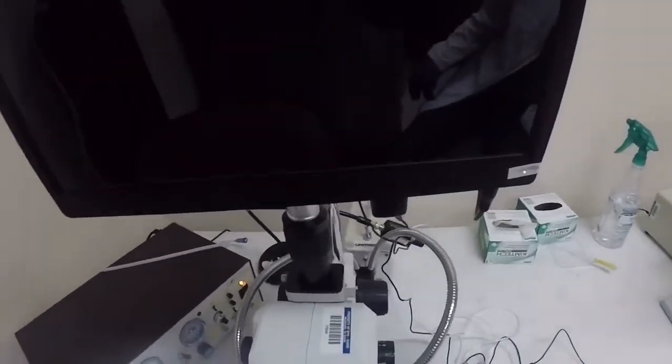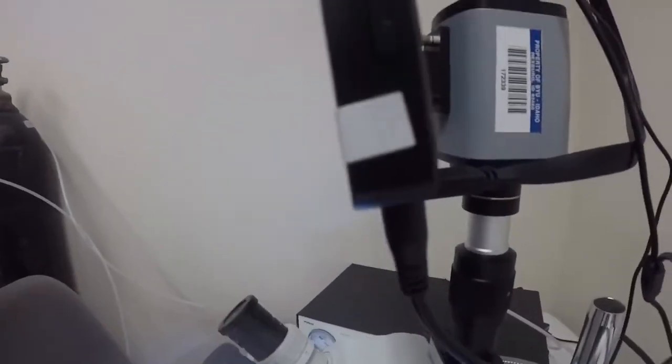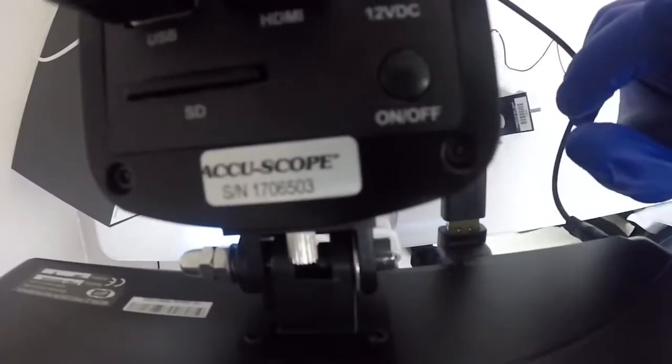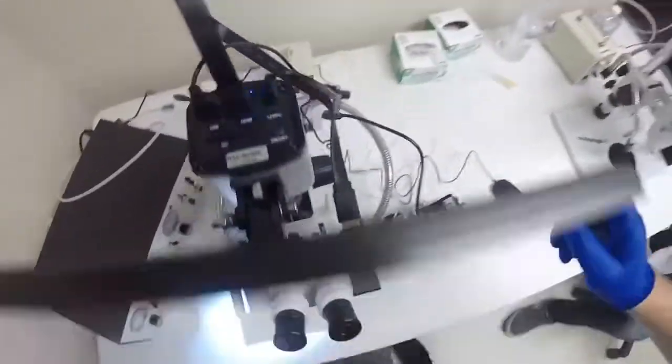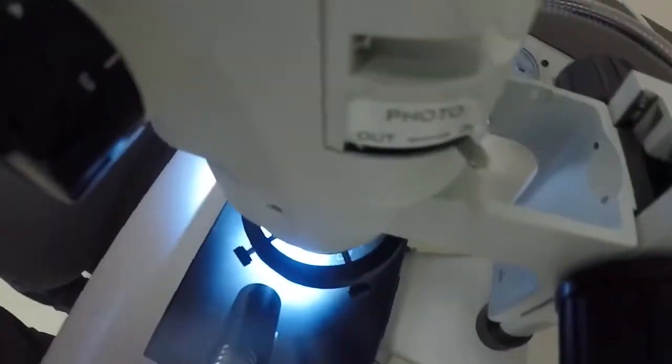If you're using the monitor, you'll want to push this power button right there on the side. You'll see that come up. There's a button on top here, you'll press on. You'll see that blue light come on, and then that no signal message will disappear. And then you will hit the switch right here.